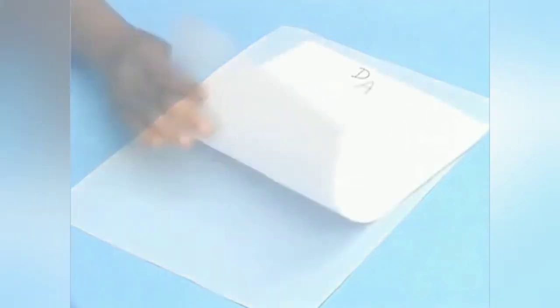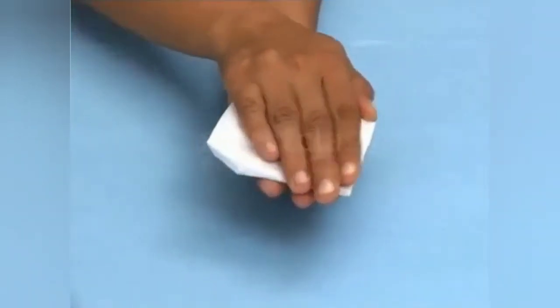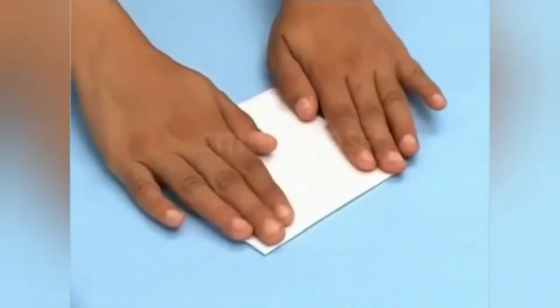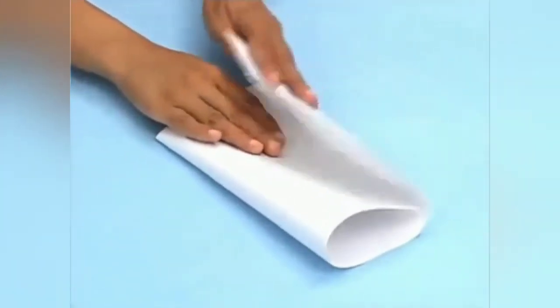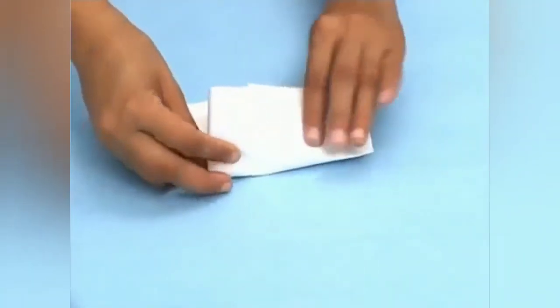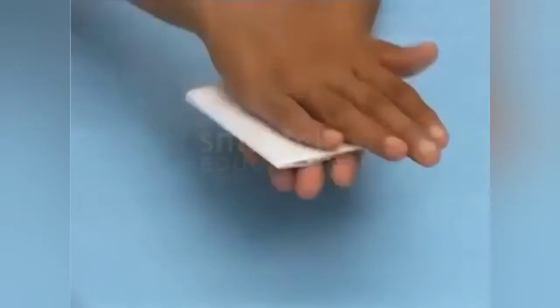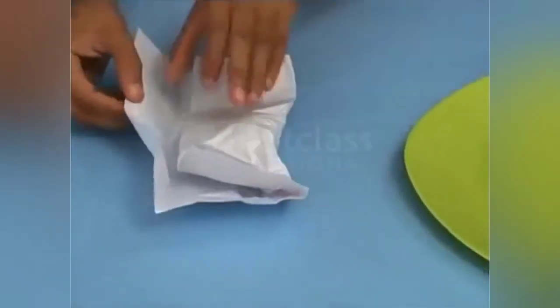Do not keep anything on paper D. Wrap each food item in its respective papers and crush them properly. Now straighten the papers and remove the food items from them.